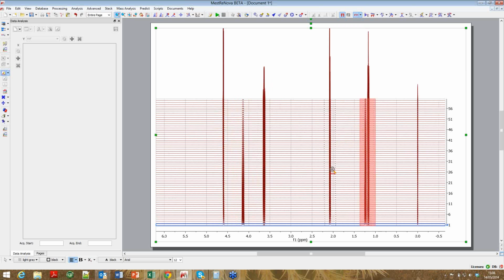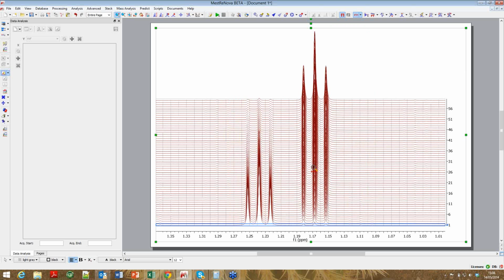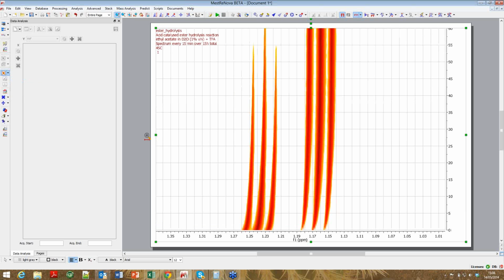So it's a bit easier now to come in and, there you can see them. Oh, maybe a little bit messy, not too bad. So it's quite easy now to come in and set your integral limits to a sensible range without having to fiddle around with the handles and move them to accommodate the moving of the peak.